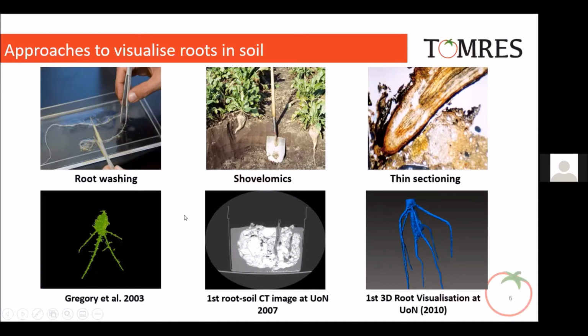At the University of Nottingham, we've been keen on this X-ray imaging technique. It was developed in the late noughties, or rather the early 2000s, when people started using it, because there were more commercially available X-ray CT systems coming onto the market for engineering and non-destructive applications.